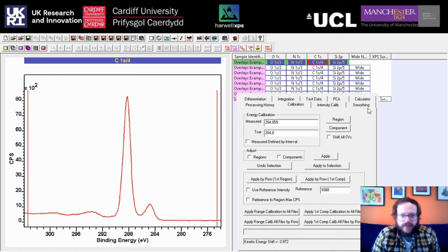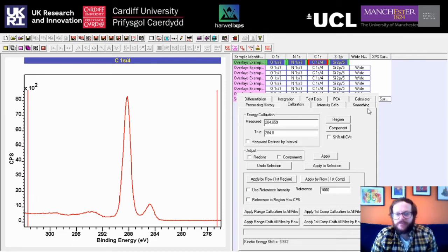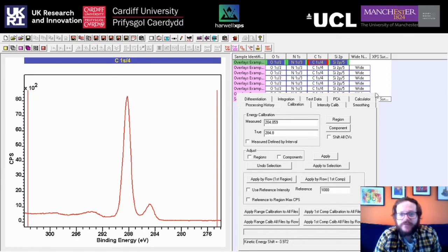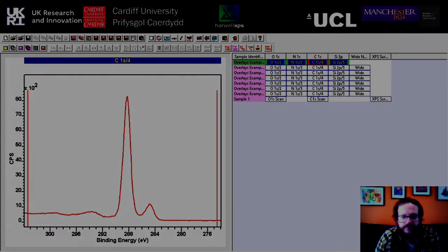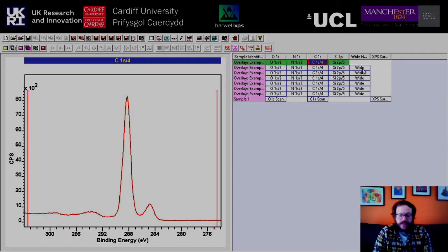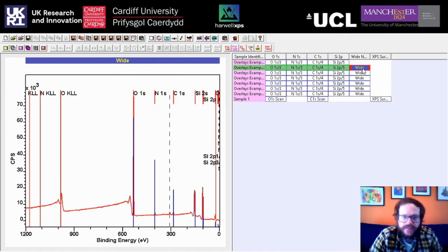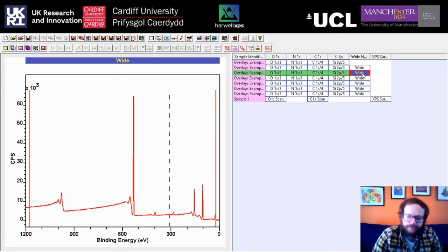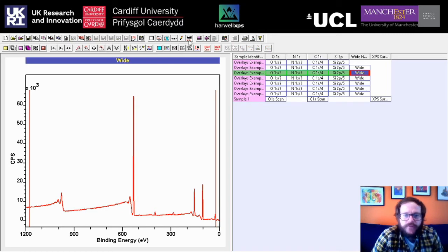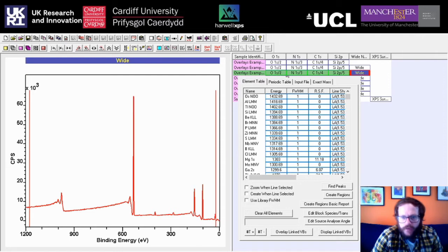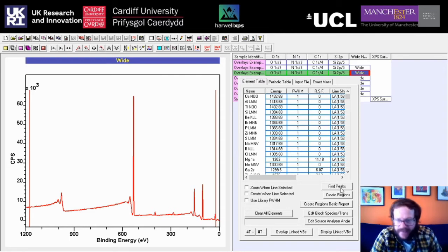For a more detailed discussion on calibration, check out one of our other YouTube videos. One of the first things we can do to process data is to look at the wide scans. If you go to the Library option or press F10, you'll find some tools including one called Find Peaks. Click on that and the software will automatically try to determine which elements are present based on the peaks it can detect in your spectrum.